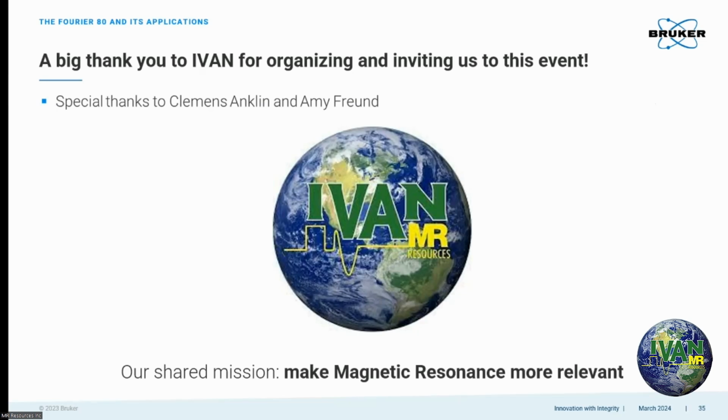Thanks. So, questions? What's the temperature range? 25 to 60 degrees Celsius.